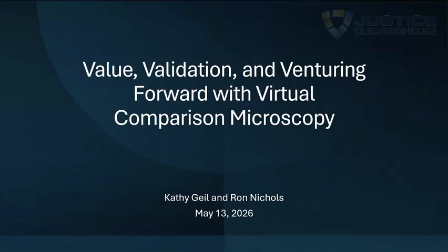Comparison Microscopy. During our webinar this morning, Kathy Geil and Ron Nichols will explore three-dimensional virtual comparison microscopy as an emerging tool for firearms and toolmark examiners. They'll examine its value in adding objective quantitative data to bullet and cartridge case comparisons, address the validation concerns that come with deploying any new forensic technology, and lay out a path forward for integrating VCM into operational workflows.